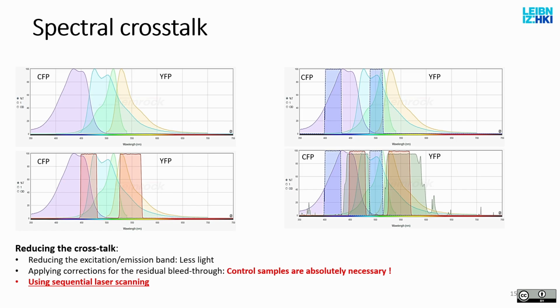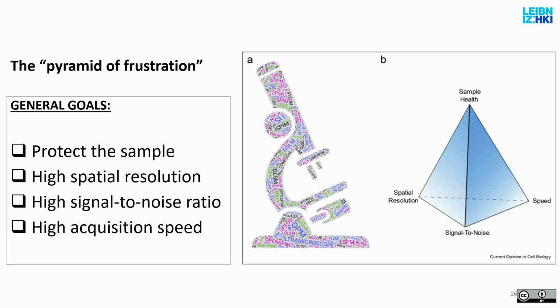Like I said, a couple of you also got the answer about the width of the spectrum, which I appreciate. And this is just a reminder of the main message from this half a day of lecture: these 4 points of view or concerns you keep in mind all the time, but you are not going to be able to satisfy all 4. Something has to give.